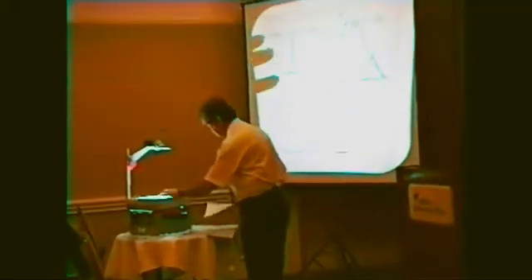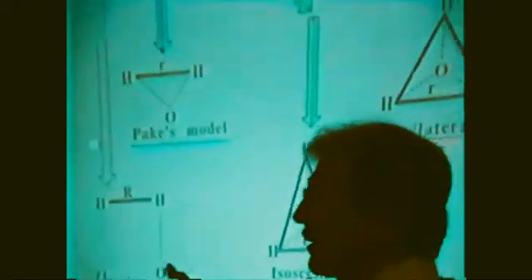And so, for studying such reaction, we must be able to do the simulation of the distribution of OH, the distribution of pair of protons. That means two protons in strong interaction.